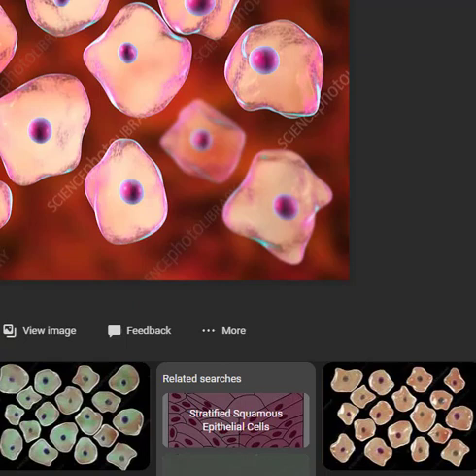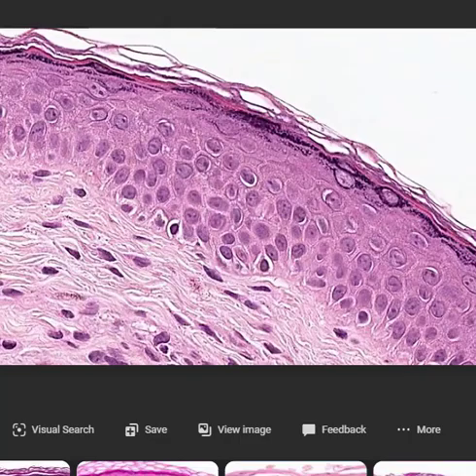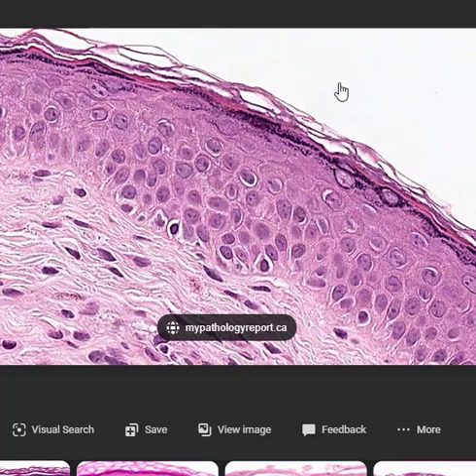Here are normal squamous epithelial cells. And this is probably what the squamous epithelial cells will look like if you're looking at them under the microscope in the laboratory. These are taken from the side, so you've taken a cross section, you cut down into the tissue, into the skin. Here's the dead outer layers, and those cells are flat.